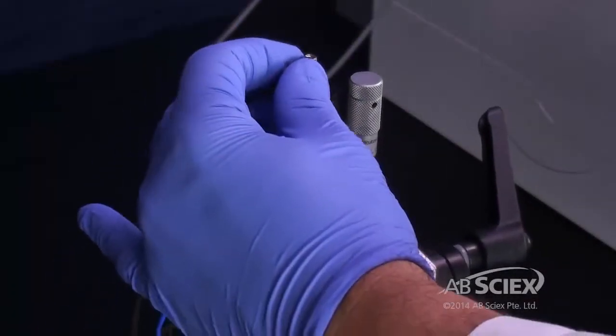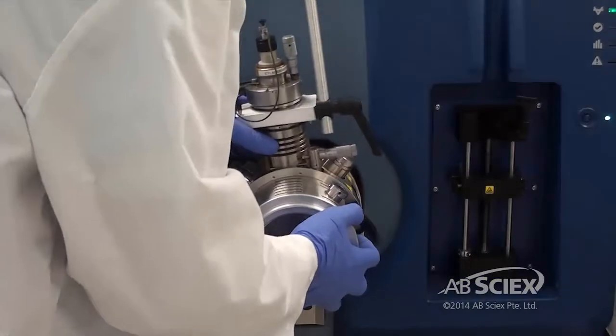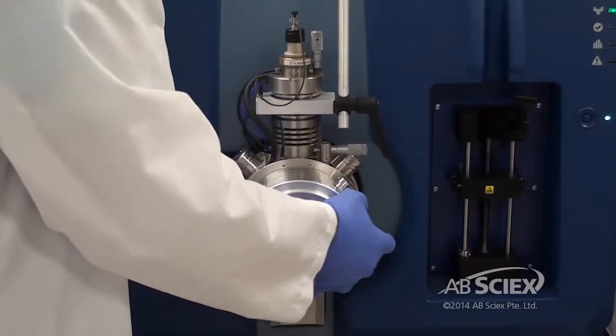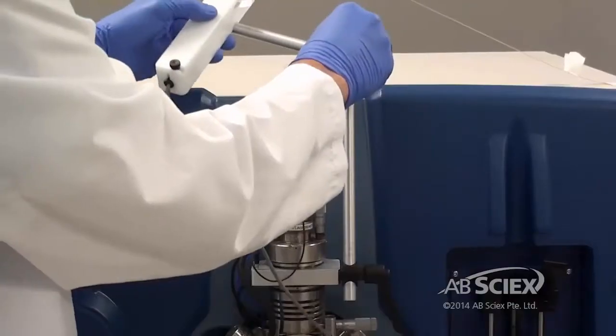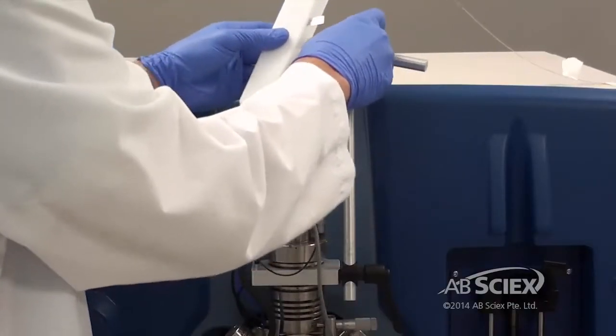Refit the grounding clip and reinstall the source onto the vacuum interface. Reinstall the column heater and reattach the column.